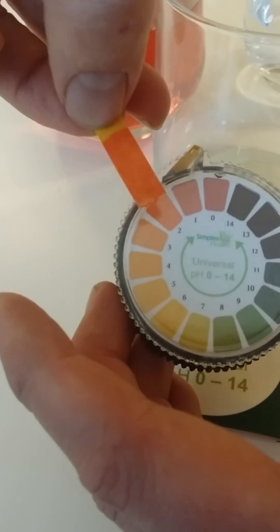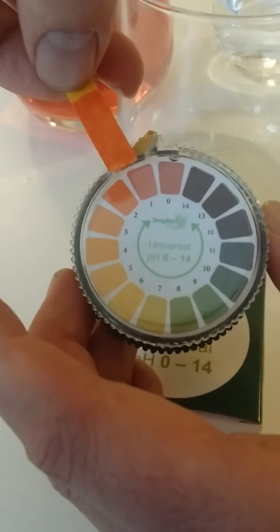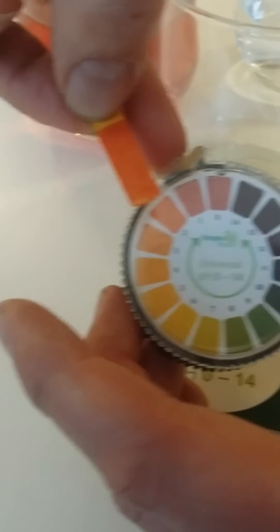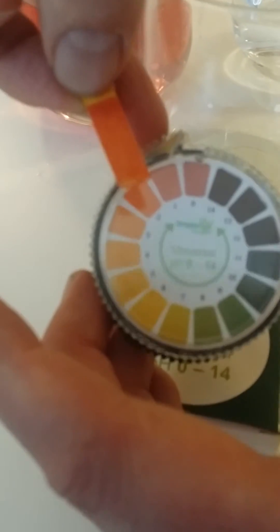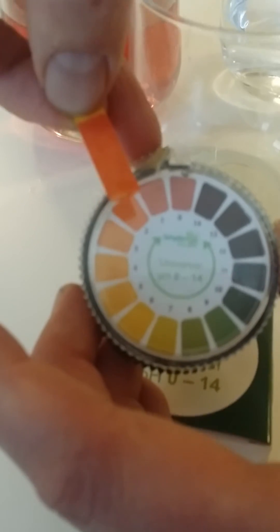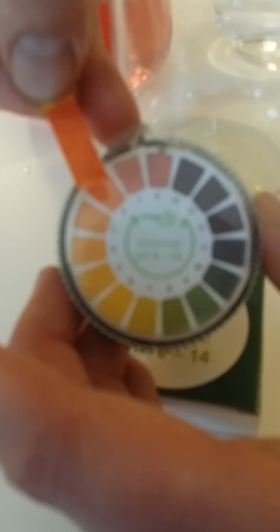We'd say that has a pH of about 2 because the pH runs from 0-14 with single increments. If the colour is slightly darker or slightly lighter you'd know it's between those numbers. So this one in particular, the white wine vinegar, you'd have a pH of about 2 — you'd actually say that's probably about 2.5.